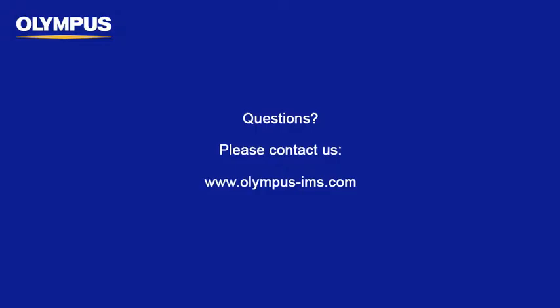In this instructional video, we have covered 2D Simple Live Panoramic Imaging within the Olympus DSX Series OptoDigital Microscopes. We hope this video has been beneficial and we invite you to contact us directly with any questions.